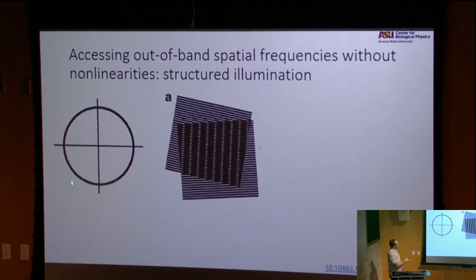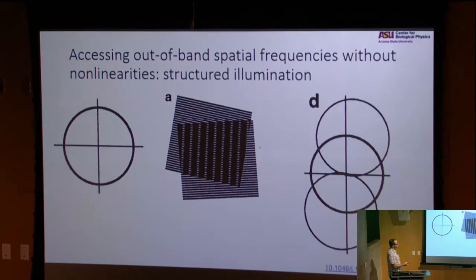There's also this idea of what's called a moiré pattern. If we take some sample that has one frequency of information, we then impose a pattern on top of that which has another frequency, we're going to get a resulting third frequency that's a combination of the two. It turns out that you can do this on a microscope by generating a standing wave at your sample, by re-interfering two laser beams. If you do it correctly, information from outside your k-max, which is this dark black circle, will be downmixed into here because it will show up as this pattern, which is something you can detect.